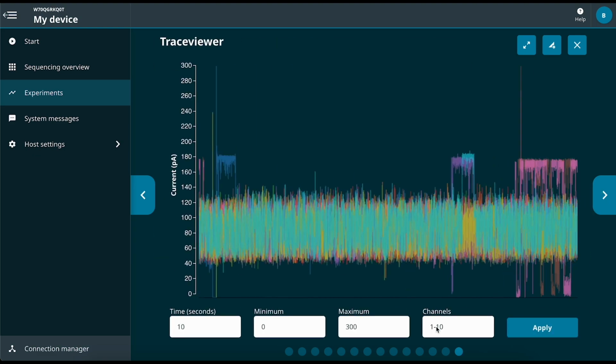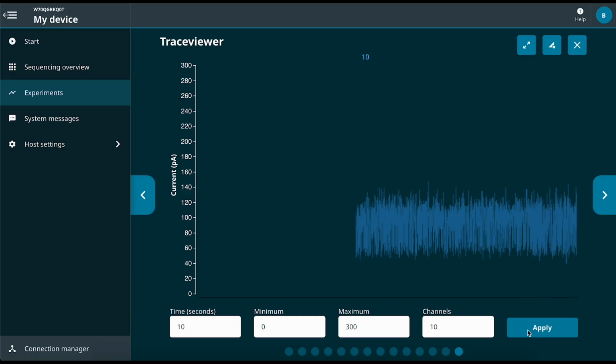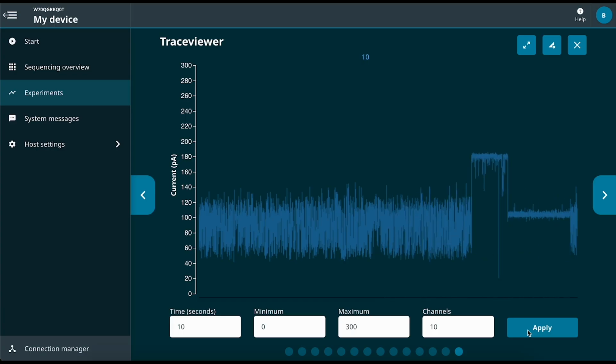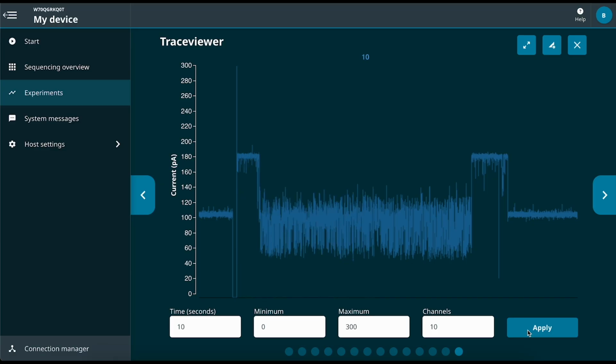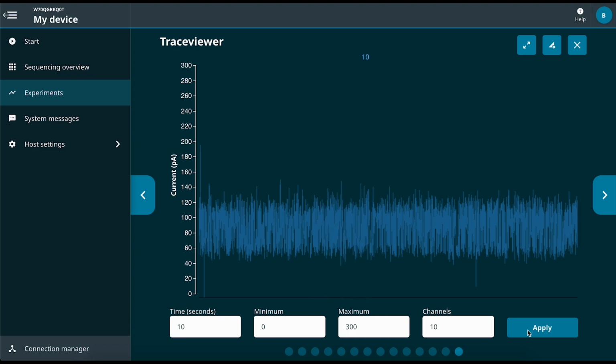And we have a trace viewer that allows you to, for any channel here, look directly at the raw signal being measured at that channel. So here in channel 10, we can see we have some DNA actively being translocated through the pore. We are generating this raw signal. This raw signal is being base called by MinKNOW to give us a nucleotide sequence. As DNA exits the pore, you'll see the current changes. As another DNA strand enters the pore, the current will change again, and you'll see this new strand sequencing, being base called, and giving you more reads.